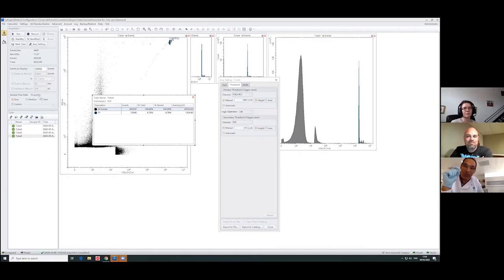As John has been indicating, we are diluting your sample. So how much volume do you need from your sample to start with for flow? Well, now you're showing all the secrets. It's less magical. It's not the magic box you put stuff in.